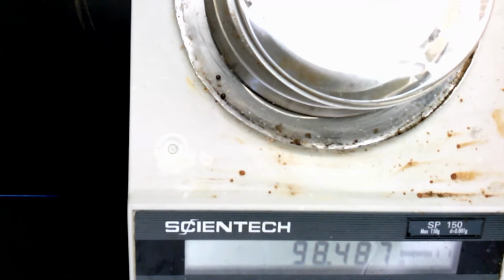Okay, now it wants me to add, I should probably write this down too. I should probably write the number down too, although I can always watch the video later. So 98.4. It's kind of jumping around a little bit. 98.495 looks pretty stable. Okay, 98.495. Don't forget your unit. That unit is grams.